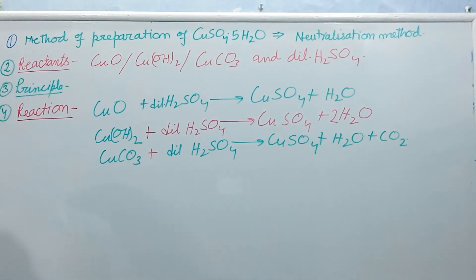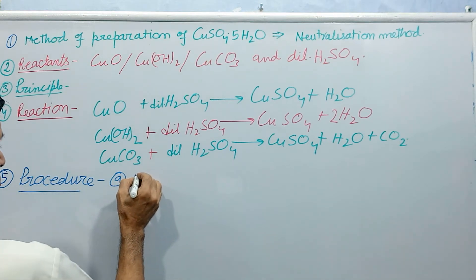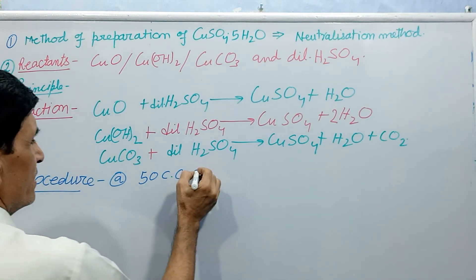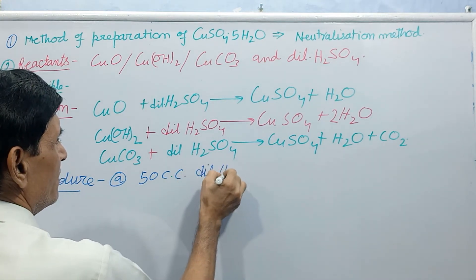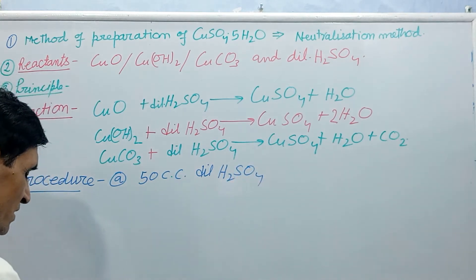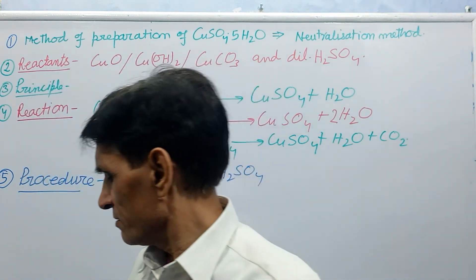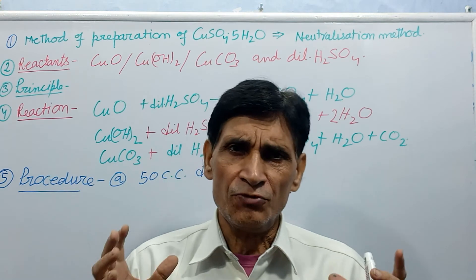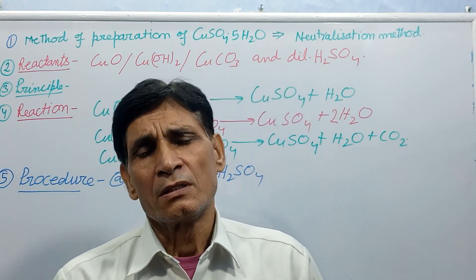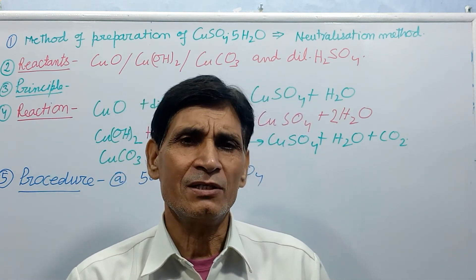Now, let us see procedure or process. Procedure number 5. First point, number A. Take about 50 cc dilute sulphuric acid in a clean beaker and warm it on wire gauze.